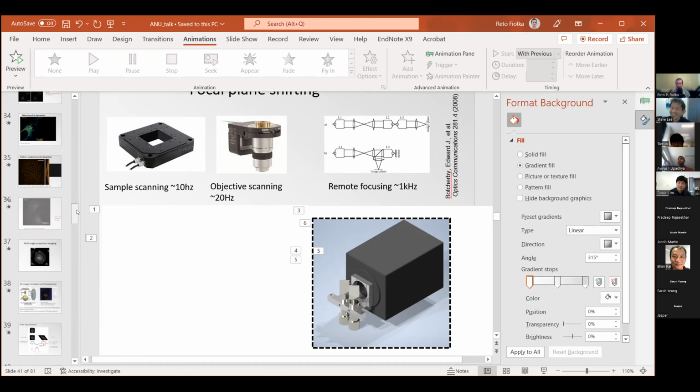But say natively the extinction ratio is 1 to 1,000, it can drop in some orientations to 1 to 50 or lower. That's good enough for SIM. Sure. Or let's say for these NAs. For TIRF SIM, it will probably be too low. But for this application, it's good enough. But I think it's not exactly the same as the image rotation, because the mirror matrices are probably a bit simpler than what happens to the polarization at weird angles. And I have to admit, we just did it empirically. So we observed it.